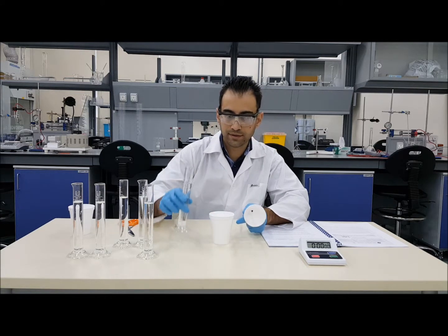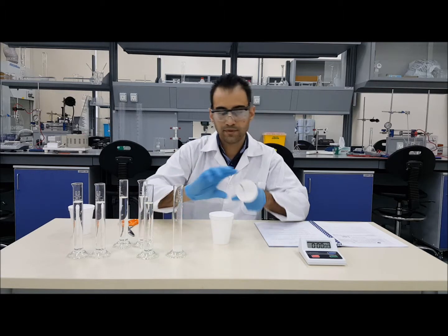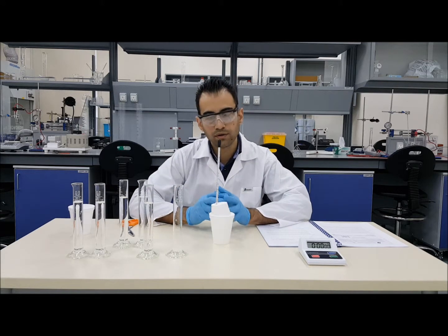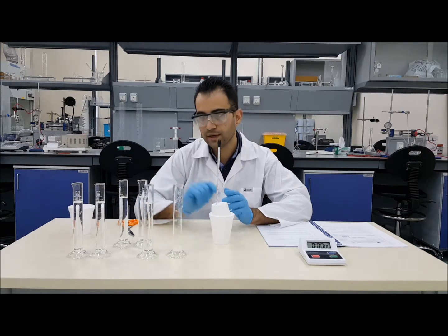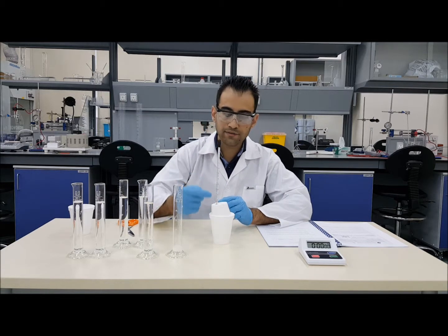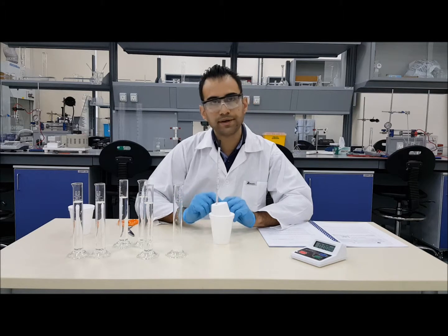So you are going to add HCl in this first trial, first to the calorimeter. Then you can use the thermometer to measure the starting temperature of the chemical. As I told you, you can either assume they are at the same temperature, or you can use the same thermometer after washing and drying it to measure the temperature of the other chemical while it's in the cylinder. After doing that, you will need to prepare your stopwatch by resetting it and get ready to add the next chemical.